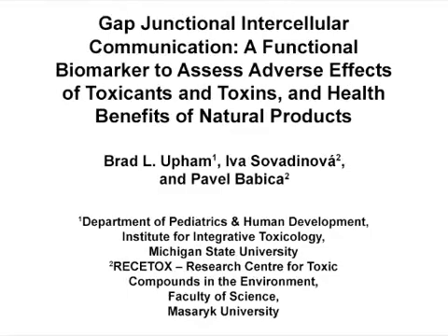The overall goal is to provide a simple assay to measure gap junctional intercellular communication through a population of mammalian cells that can serve a broad range of in vitro pharmacological and toxicological needs. This method can help answer key questions in the toxicology field, such as whether a compound affects the development or maintenance of a tissue by dysregulating gap junctional intercellular communication.